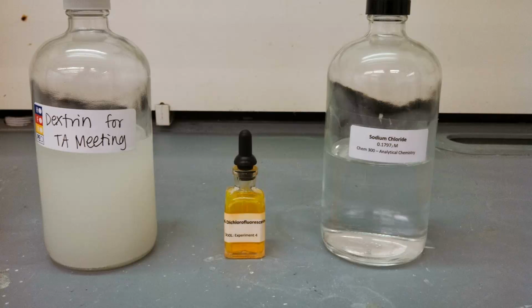In addition to this, your weigh bottle that you left at the end of experiment 3 will have silver nitrate, which you'll use to make your titrant solution. And you'll also get an unknown in a small unknown bottle.